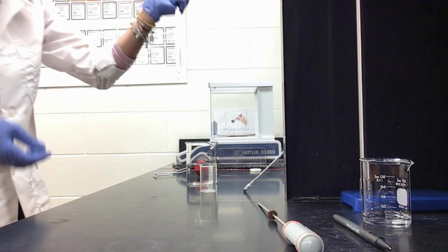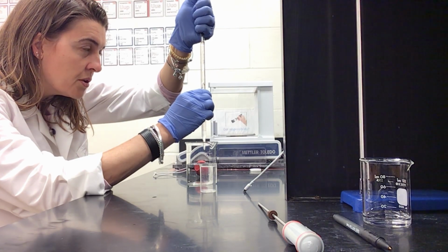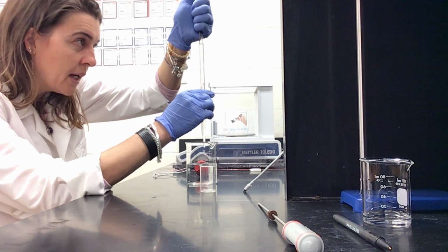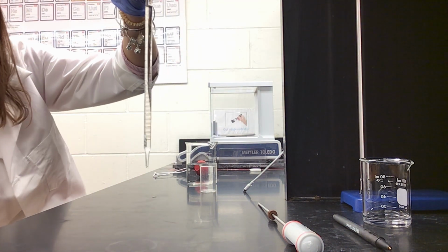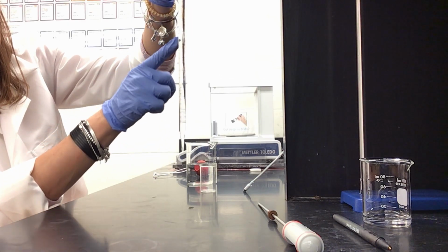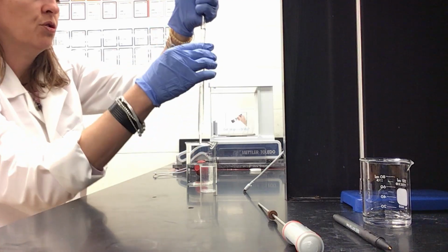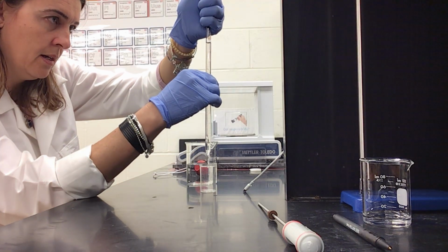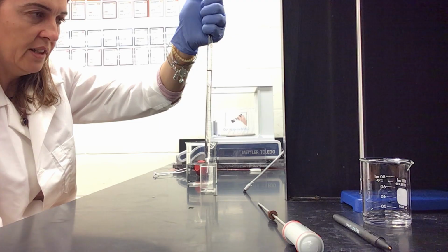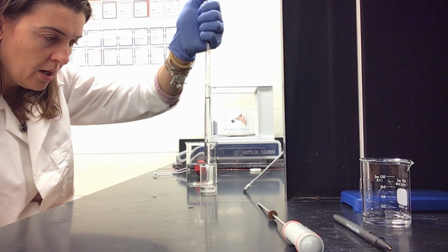So now I'm gonna return here and do it again until the meniscus reaches the 0 marking. All right. So now I am at 0 right here, and when I'm gonna release the 10 milliliters in the vial, I will stop right here, okay? So let me go down. I can go a little bit faster until I arrive at 9 maybe, okay? Because then I will have to look at the meniscus at the 10 marking.